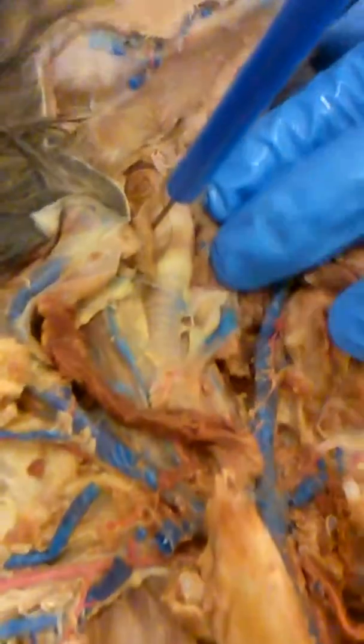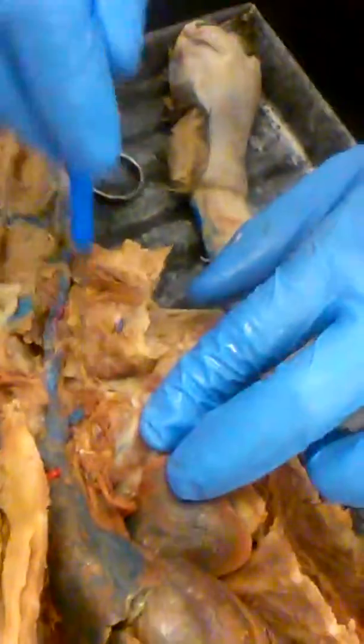All right, now you need to know the endocrine organs too. Thyroid. Like knowing what we need to know for the body. Thyroid, thymus. The thymus is going to look like a chewed piece of meat over the top of the heart. It looks like it's flipped back.